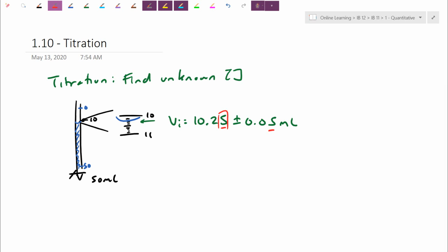That doesn't mean, though, I actually have 10.25 mL in my burette. Like we mentioned, the numbers are upside down. I probably have about 30, 40 mL in here. What I'm going to do here is have my starting reading. After I'm completely done my titration, some of this solution would have been dumped out. I'm just going to make a new reading. And again, I'm going to have a final reading, a number read to 2 decimal places. Maybe just for argument's sake, 31.67.